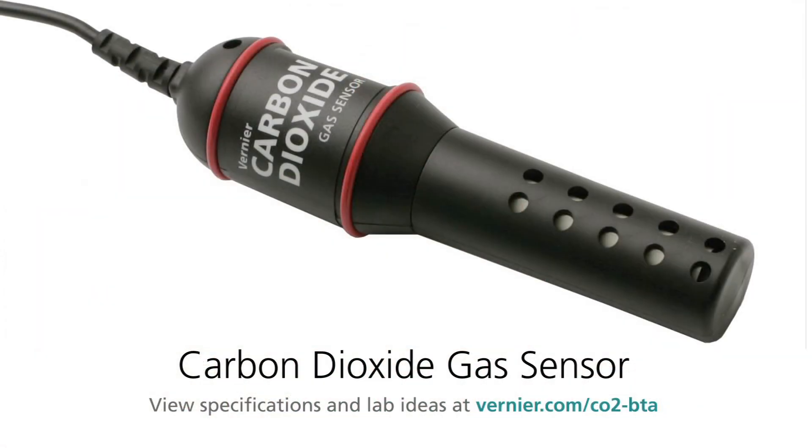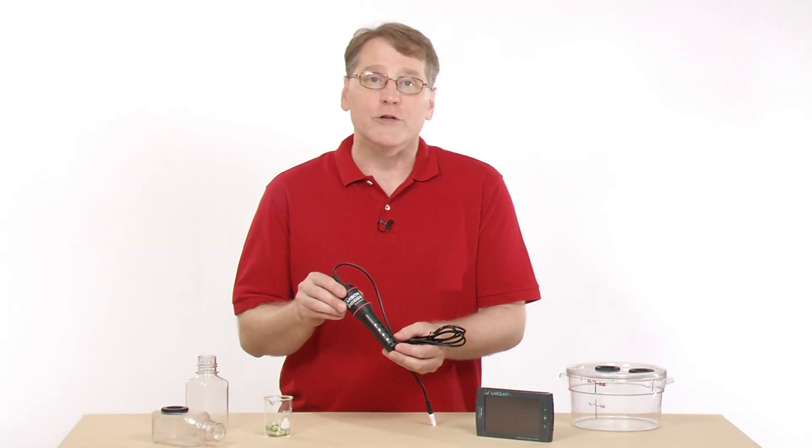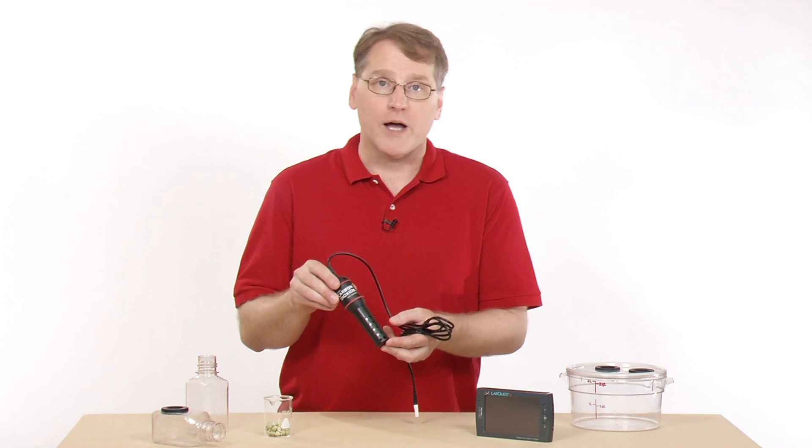This is the carbon dioxide sensor. It's used in several of our lab manuals — it shows up in the biology manual and the physiology manual. It's used to measure the concentration of carbon dioxide gas.